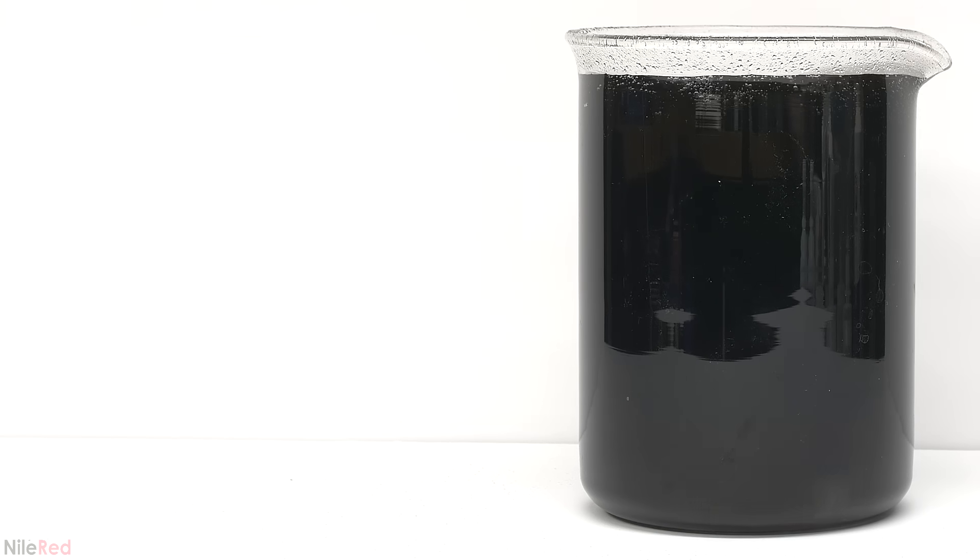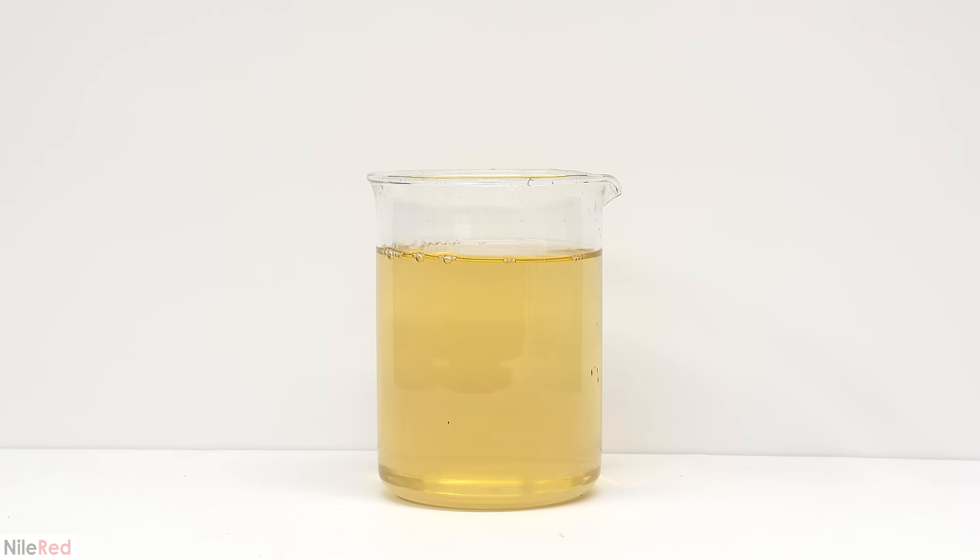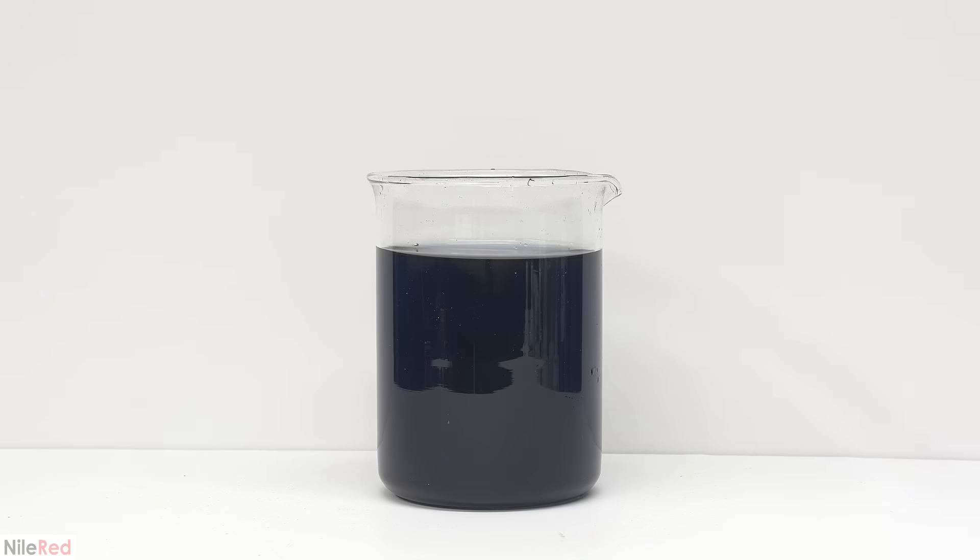Now we're done with all the complicated stuff and we can move on to just playing with the reaction. One interesting thing to do is to mix all of the solutions together, but to not stir them. Without the stirring, the reaction isn't uniform and I think it gives it a cool effect.